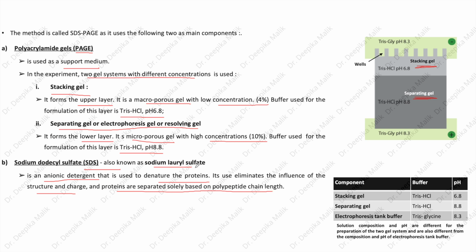So important points to remember here are that solution composition and pH are different for the preparation of the two gel systems and are also different from the composition and pH of electrophoresis tank buffer.